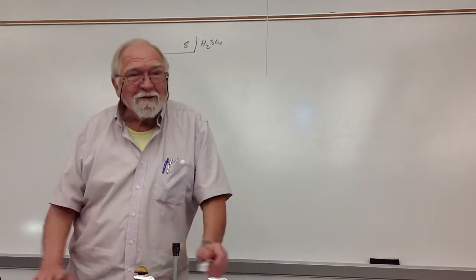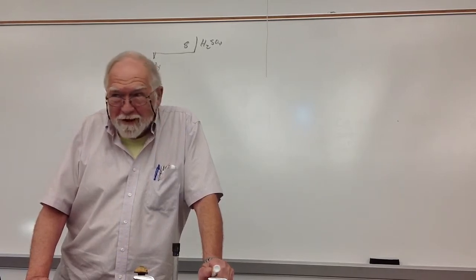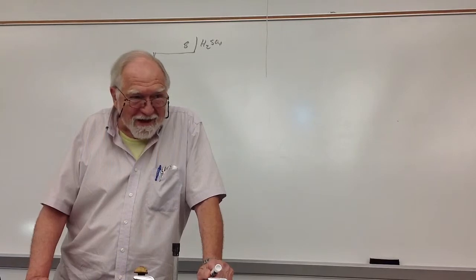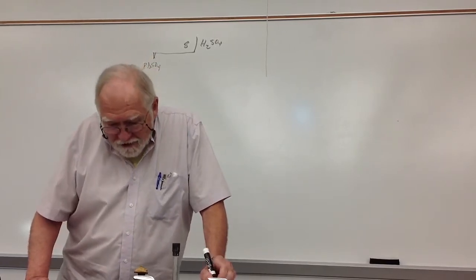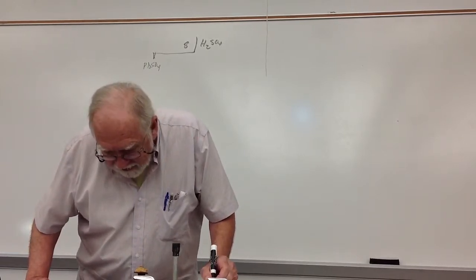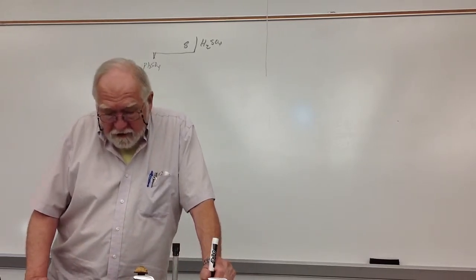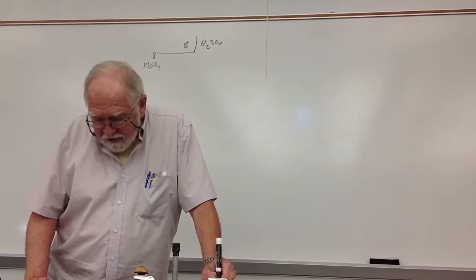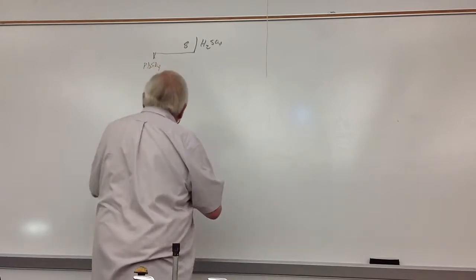So it's hidden here almost at the end of procedure 8. And people always miss that, and then they get to procedure 9 and they say, what should I use? And they can't find the test tube that they need. So make sure you note that where it says, it's down about the 7th or 8th line, I'm not counting too carefully. Save the decantate for procedure 9, goes on to tell you what to do with the precipitate. So in procedure 9 now, you have the decantate from 8, and you're adding 15 molar ammonia.